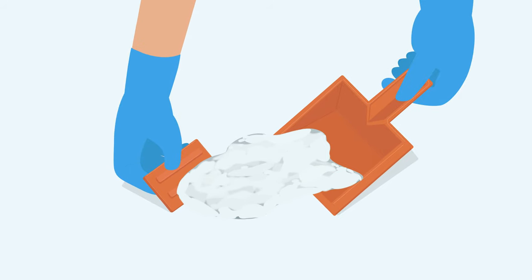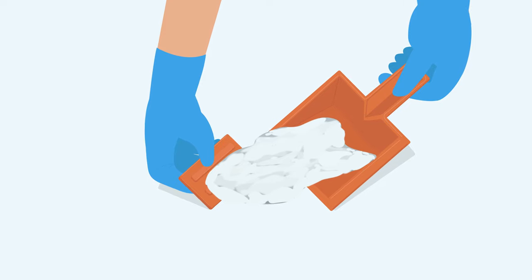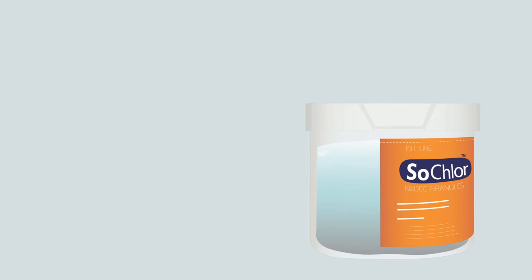Using the scoop and scraper provided, remove the absorbed spill and excess granules from the site and dispose into the bag. Place scoop and scraper into bag once all material from the spill site is removed.